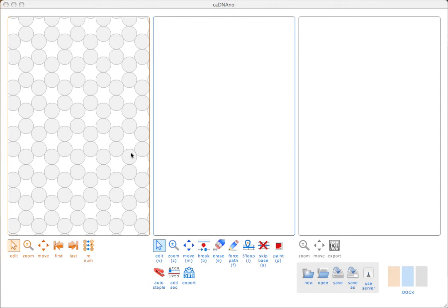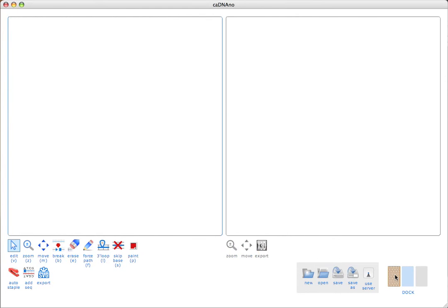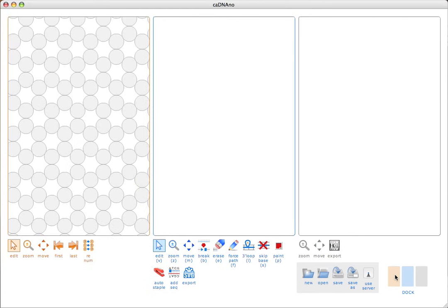You'll notice that there are three main panels in the interface, along with a toolbar for saving and loading data, and a dock that can be used to hide or show any of the panels. I'll just jump right in and then stop and explain parts of the interface as I go. I'm going to start by clicking in the left panel to add six helices that I want to work with.